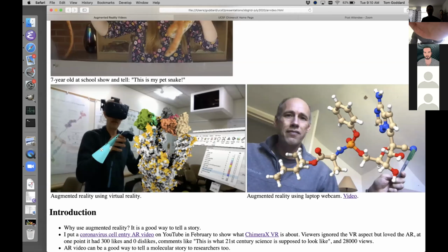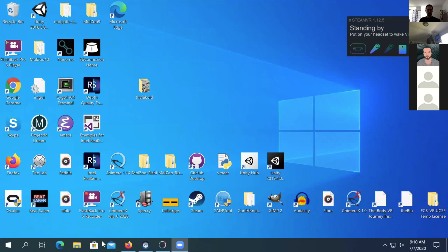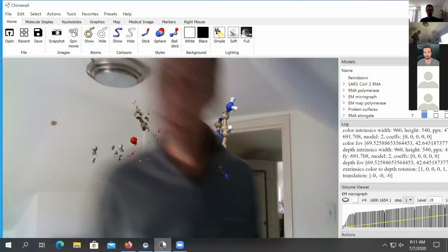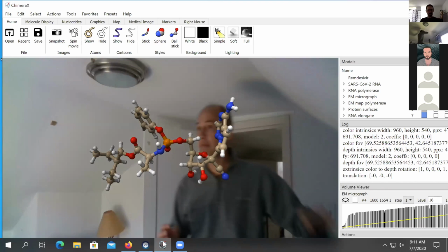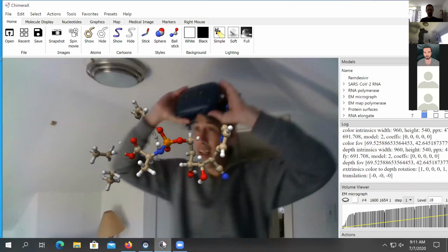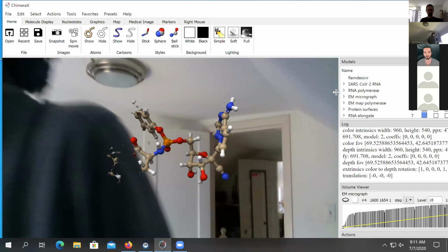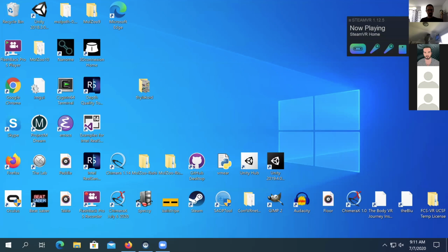I'm going to switch to my Windows machine if I can. I'll try to share my screen here. All right, we've still got your Mac up there. Okay, yeah, I'm just switching here. Let's see if it... Yep, it's looking like it's picked up. So we're on my Windows machine now. And I have ChimeraX running here, and I have my VR headset. Let's see, is this right? Yep. Oh, but hold on, I'm going to restart ChimeraX because in my little test, I forgot to do something important. So I'm going to just start ChimeraX.